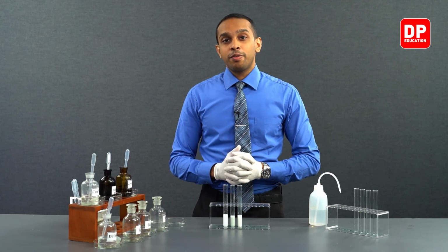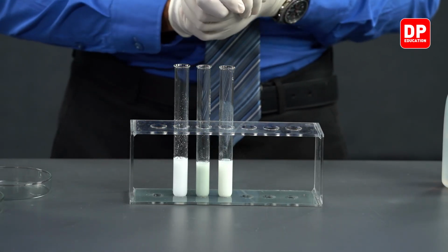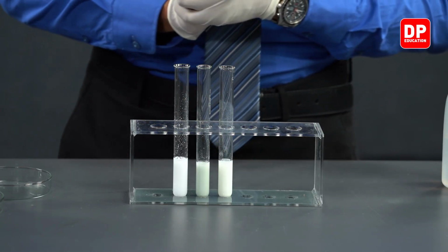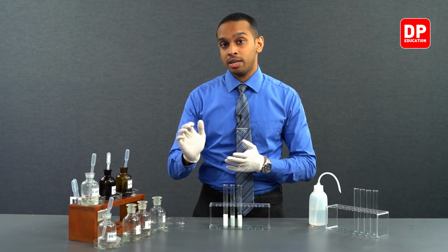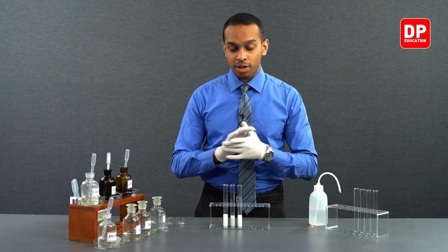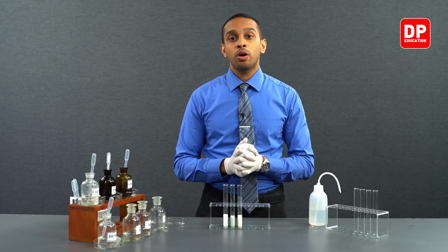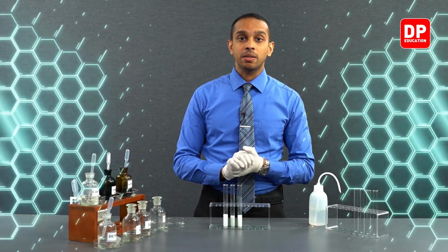All right, everyone. So that is the comparison of the three precipitates formed when chloride ions, bromide ions, and iodide ions are reacted with silver nitrate. I hope you can see the colors separately. And now let's move on to the next step in our practical.